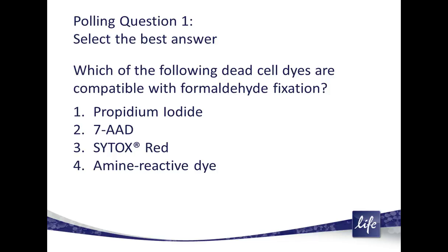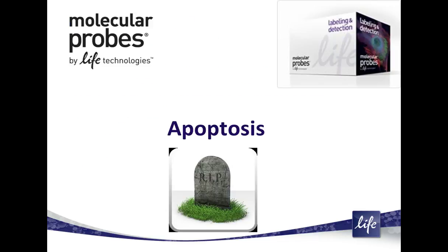All right, so we'll return back to our presentation. And we'll move our focus to apoptosis assays. And the icon here is the icon, again, from the Cell Imaging mobile app. And I'll remind you that a similar mobile app is coming soon for flow cytometry.